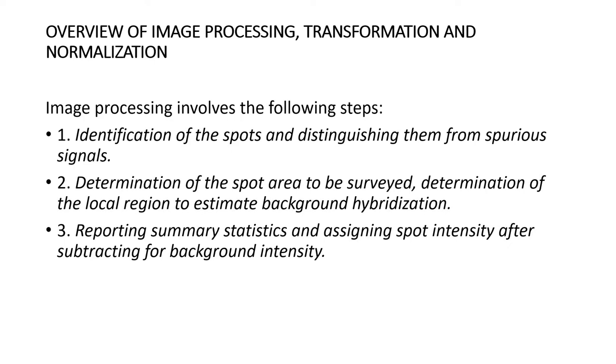Welcome to class of high throughput data generation and analysis. Dear students, today we are going to learn image processing of microarrays.